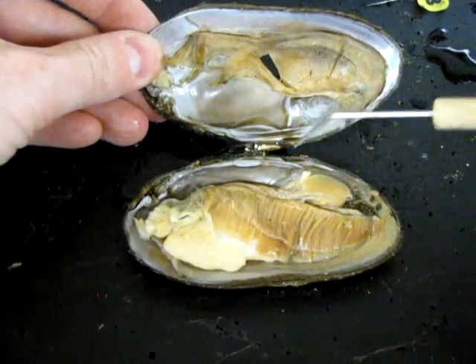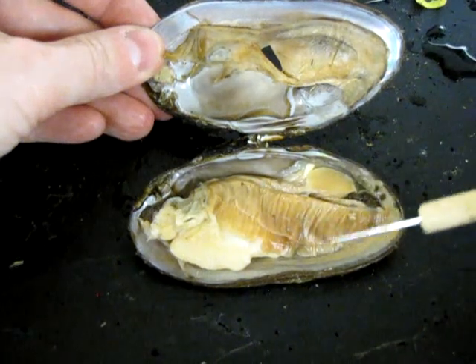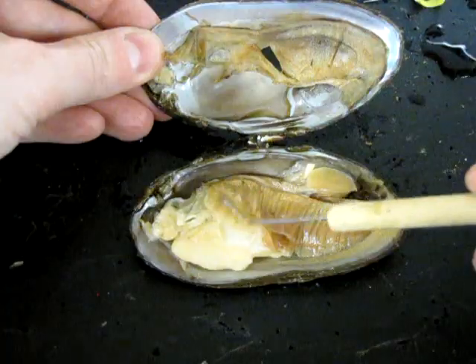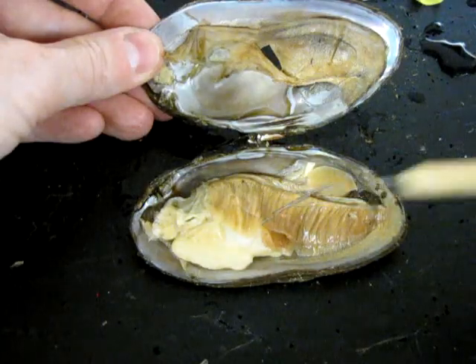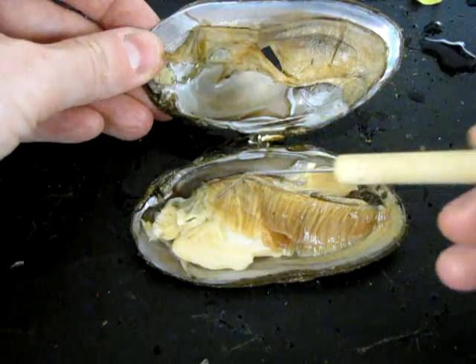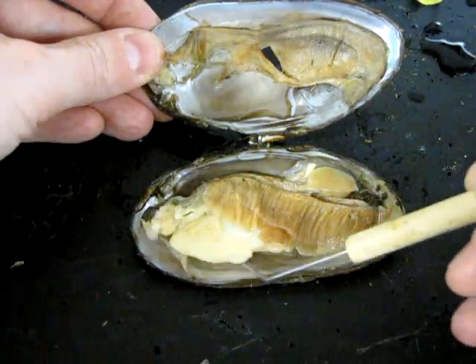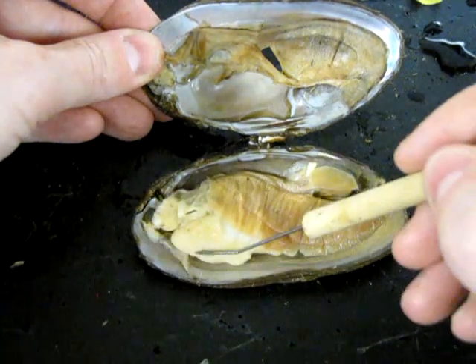Now we'll look in the mantle cavity, which is basically just the body cavity. The first thing you'll notice are these long, dark-colored, conspicuous, very thin, feathery-looking gills — this is the surface of gas exchange. Water enters the mantle cavity via an incurrent siphon formed at the rear by the mantle. Gas exchange takes place and waste products are ejected via the excurrent siphon, also at the posterior end. There's another set of gills on the underside, along the right valve.